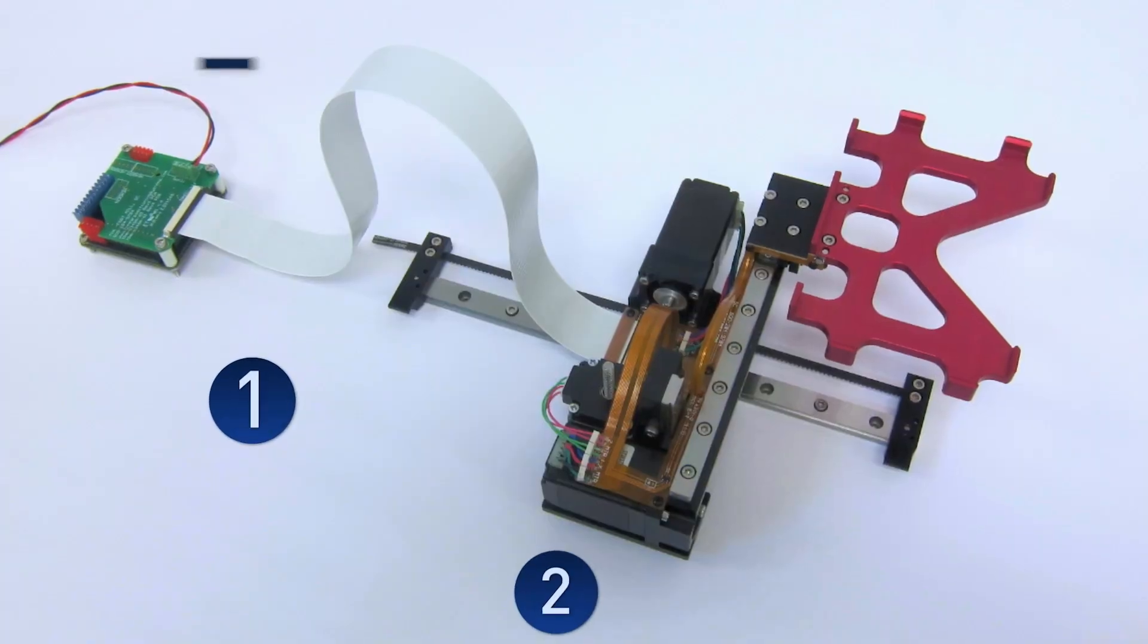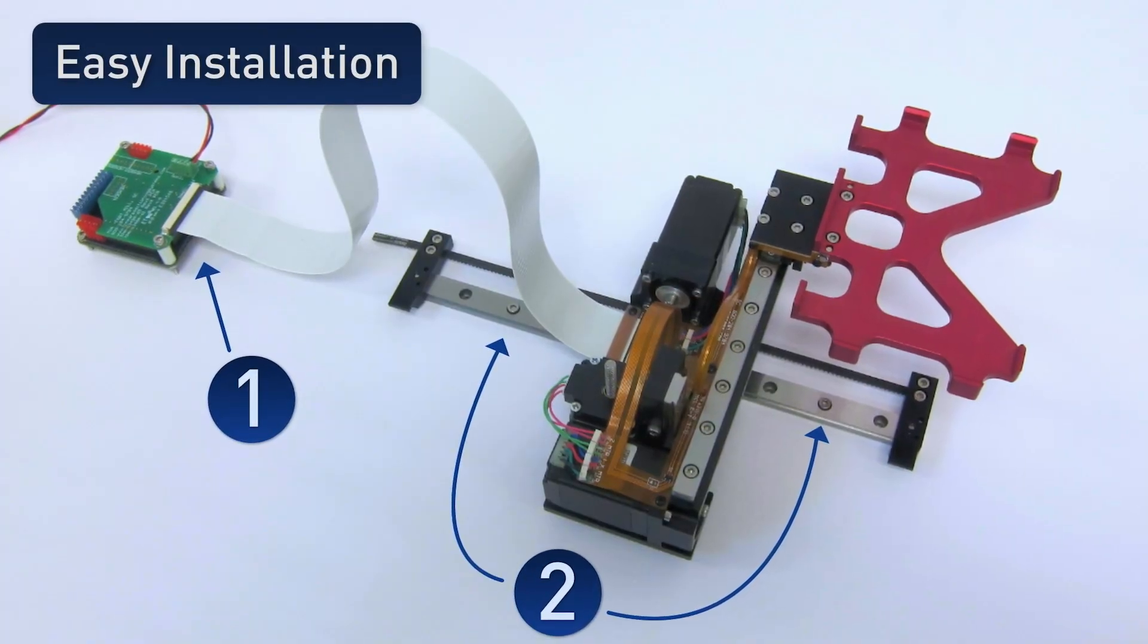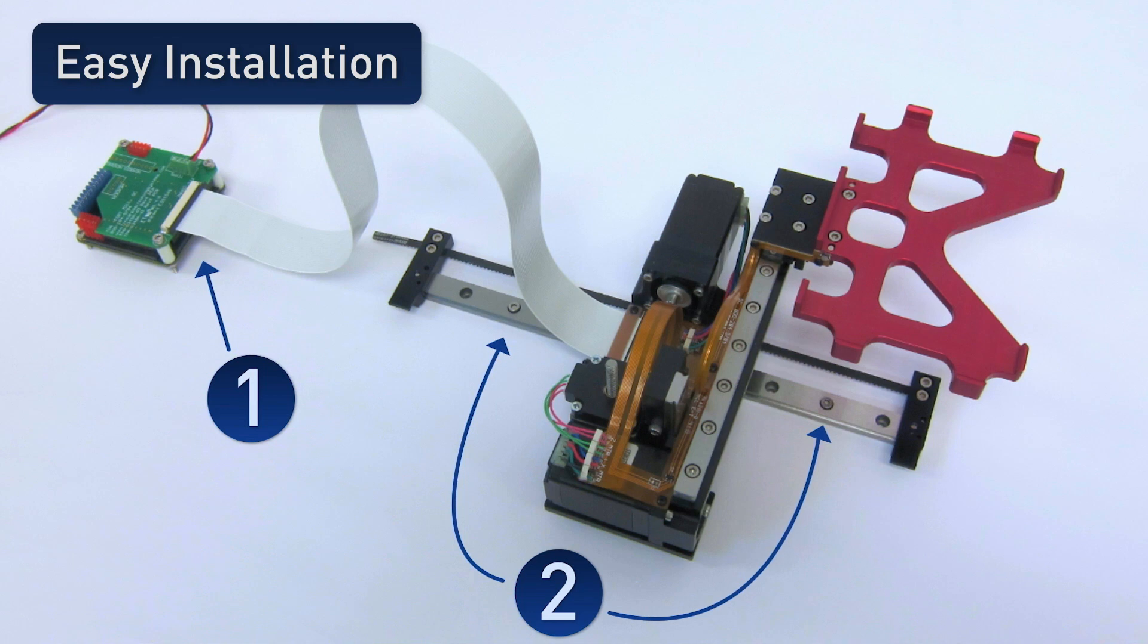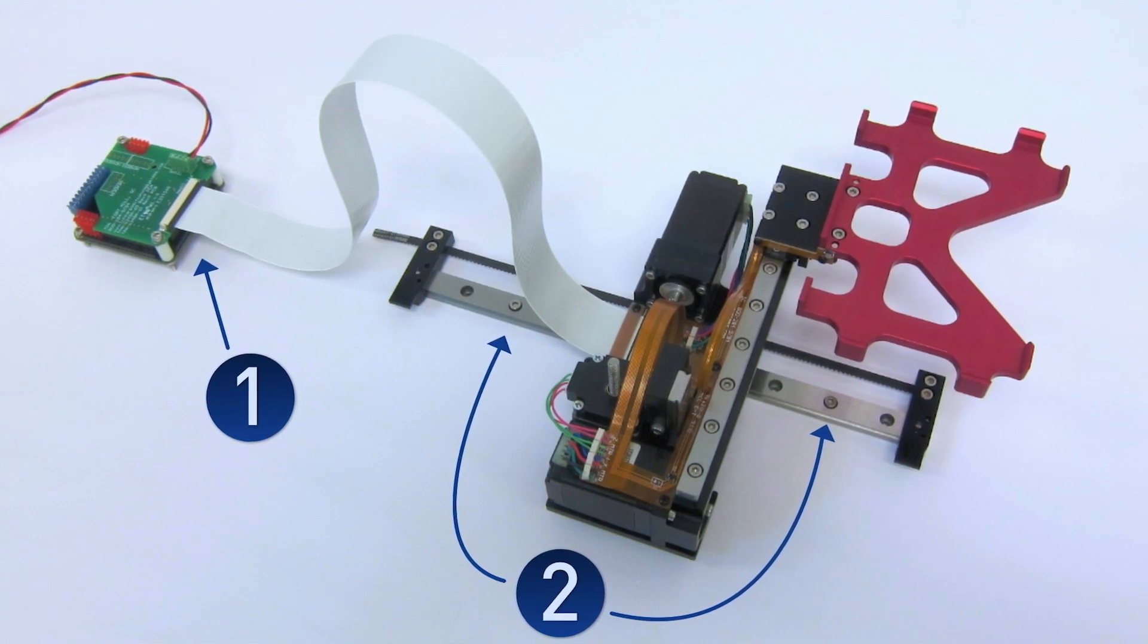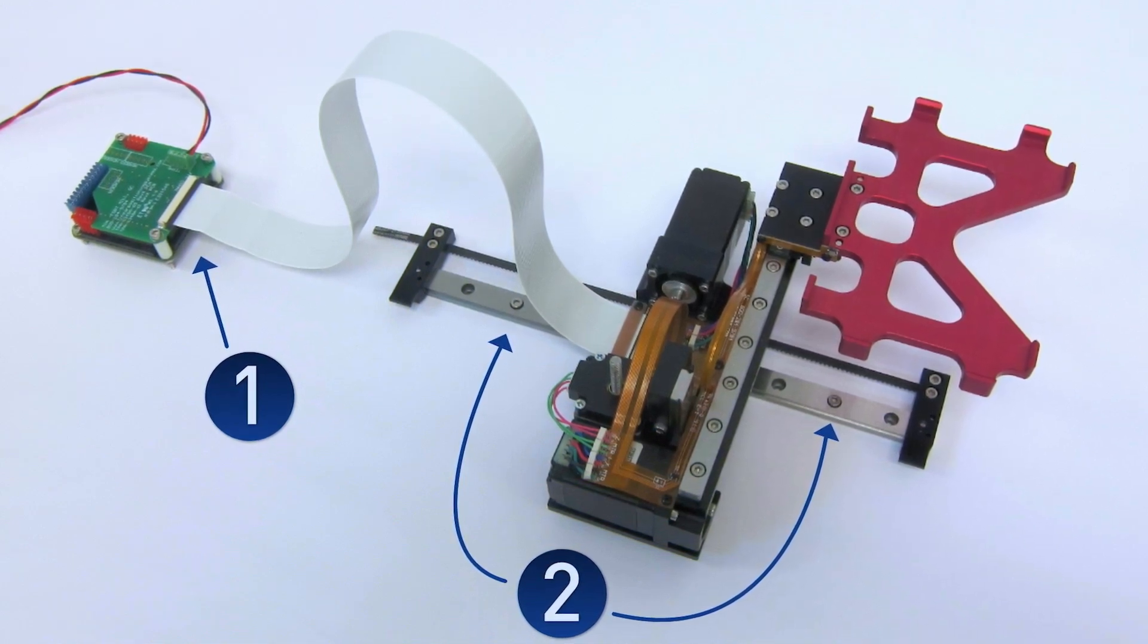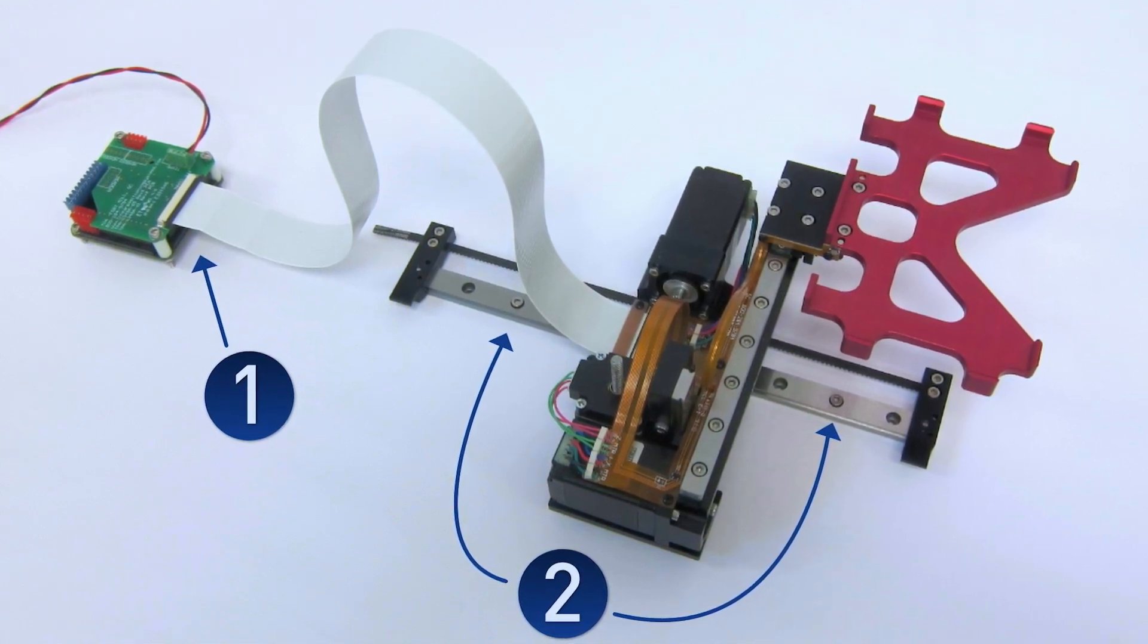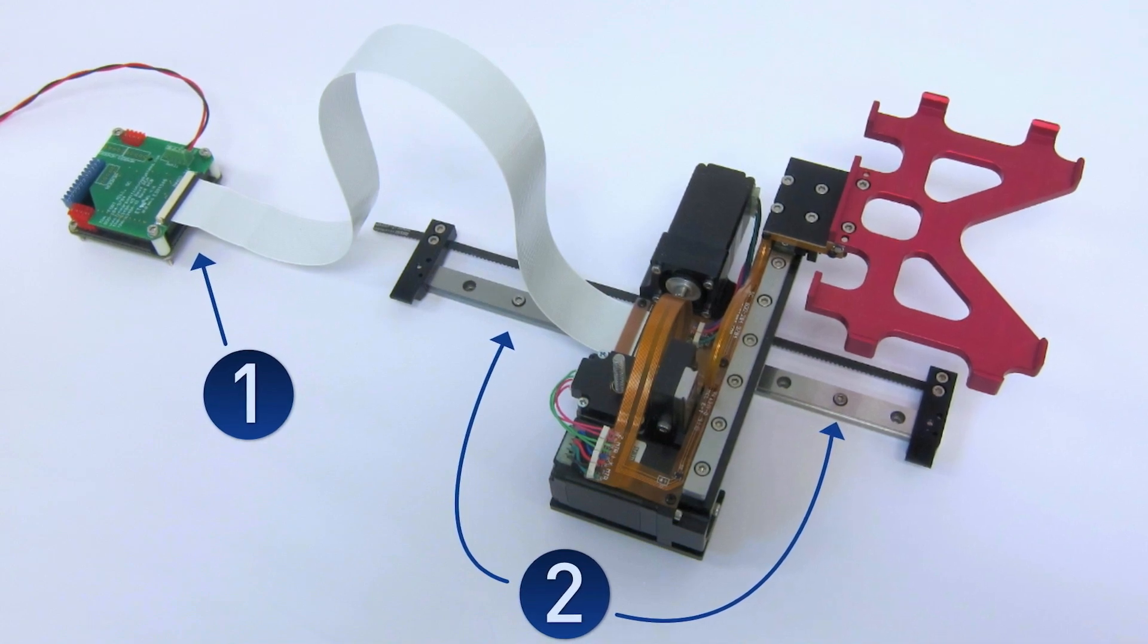Because of the single electrical connection, installation of the plate robot is as easy as one, two. With one electrical connection and two fasteners, the robot can be fully installed in your instrument.